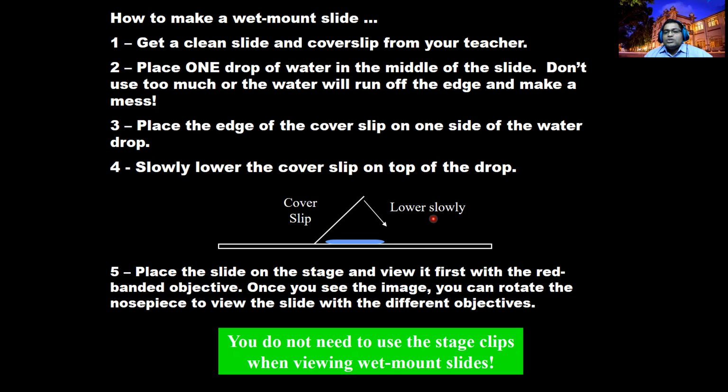Right, so you don't need to use the stage clips when viewing the wet mount slides. For wet mount slides, you need not put the clips, whatever clips are available on the microscope. Why? Because this slide is fully covered, so the specimen does not get damaged.